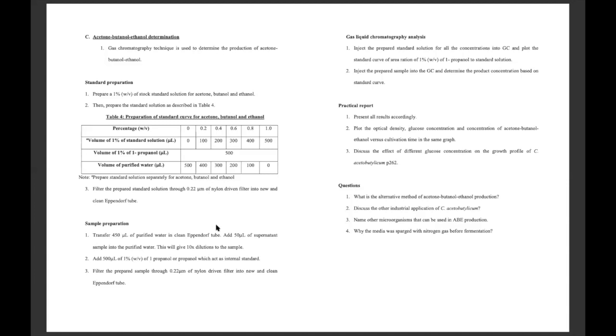Once you prepare, as I mentioned before, you need to prepare the standard before you analyze your sample. So go for the standard first, make sure your standard is good. As usual, the standard curve, you remember how it looks. It needs to be a straight line, possibly with R squared near 0.998, then it will be good to be used for your analysis. Once you have a very good standard, then you can start preparing your sample.